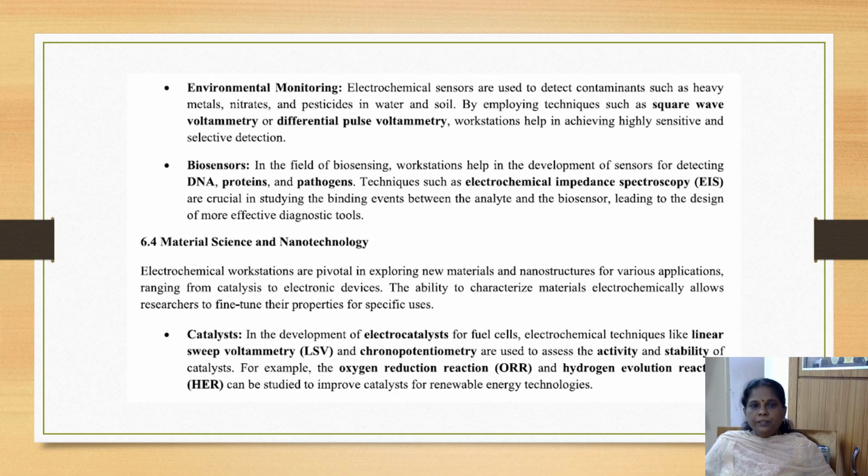In environmental monitoring also, we can use electrochemical sensors that detect contaminants such as heavy metals, nitrates, and pesticides in water and soil. By employing techniques such as square wave voltammetry or differential pulse voltammetry, workstations help in achieving highly sensitive and selective detection of these contaminants.